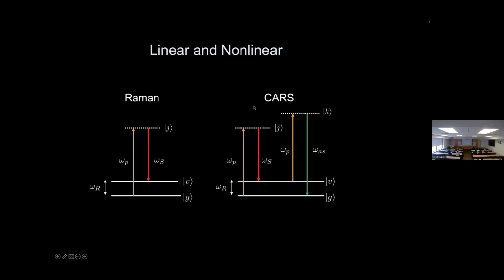Seems like magic, but it actually really works. Okay, the difference between regular Raman and coherent Raman can be really dramatic, up to 6 orders of magnitude. And that is extremely significant if you want to do imaging. I mean, 6 orders of magnitude in terms of time spent in taking an image is just absolutely enormous, right? So that's why this trick is really useful in practice.